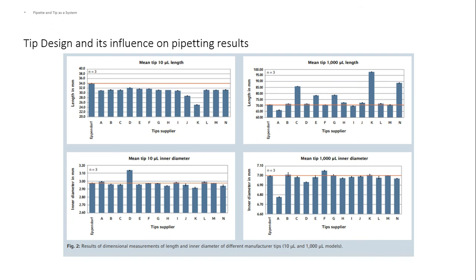So we have a comparison. Please choose the best pipette tip, or at least buy the same brand of pipette and pipette tips.